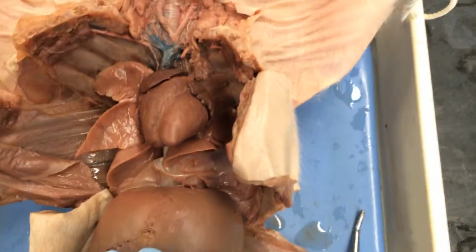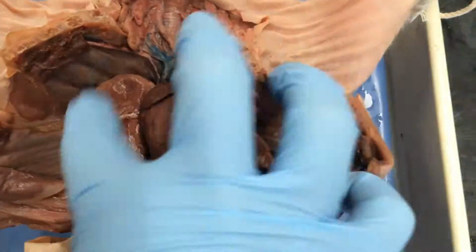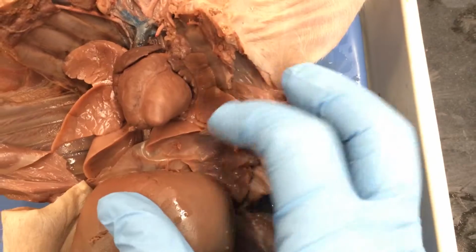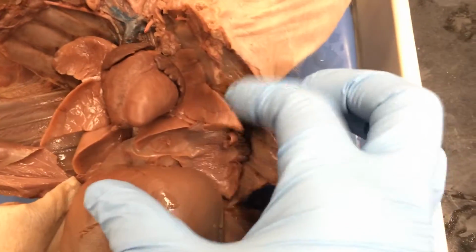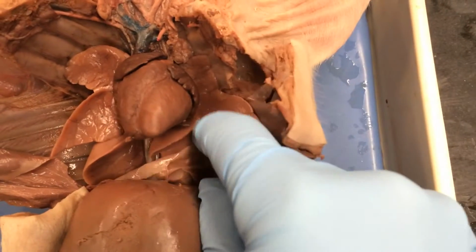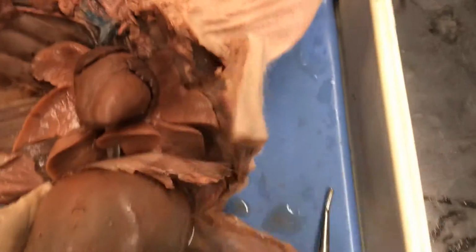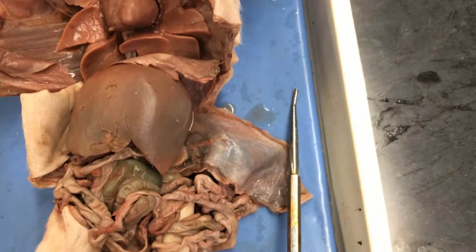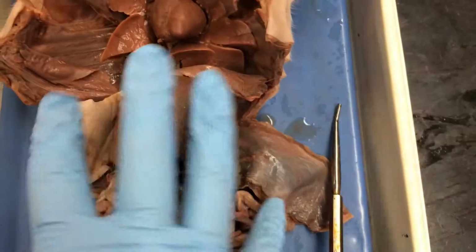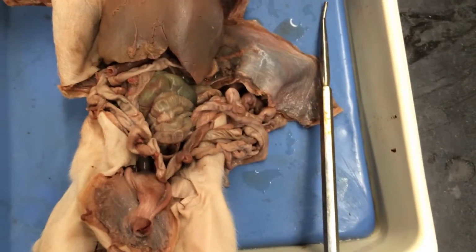Okay, this video is about the circulatory system in the fetal pig. This region here is the thoracic cavity, which contains the heart, the lungs, and a membrane that's been cut off now. This quite thick membrane here is called the diaphragm. The peripheral side here that we talked about last time, this is all the abdominal cavity that contains the digestive organs, the excretory organs, and also the reproductive organs.